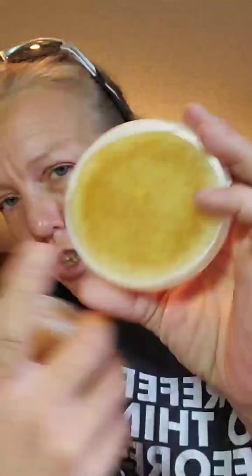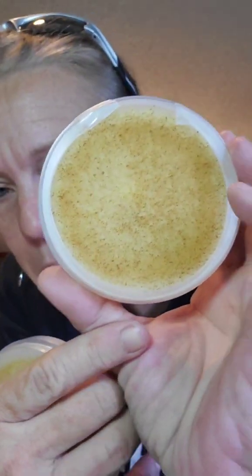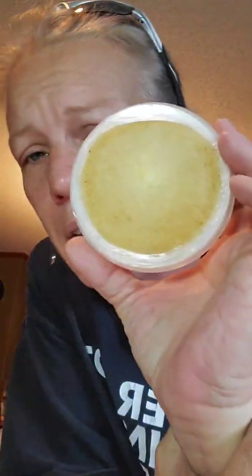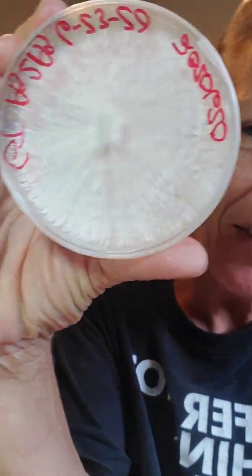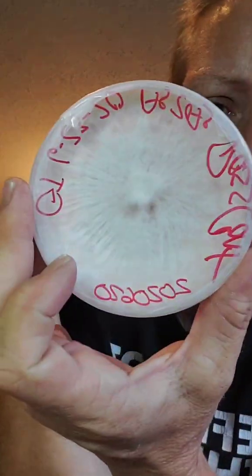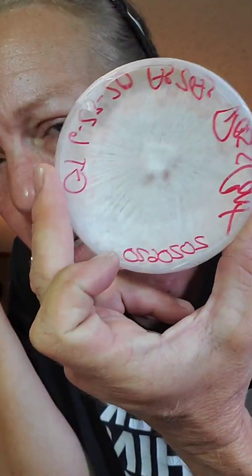What we're going to be working on today is agar. This crazy stuff that's in a plate. Now, this stuff that's on the bottom is not contamination. Okay? That's actually nutrients that I'm going to show you how to do in a minute. That's actually probably the yeast that is fueling that. Let's see if I can get that on there. I got lighting set up and it's reflecting.